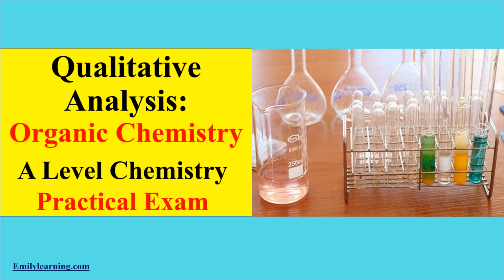So in this video, I'll be going through a qualitative analysis question from the A-level H2 chemistry practical exam. As you know for QA, typical types of questions will be testing for cations and anions, redox, that means oxidizing and reducing agent, as well as organic chemistry. So for this video here, we'll be looking at an example from QA organic chemistry.